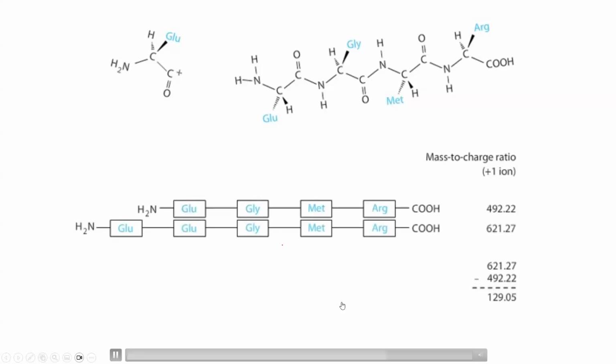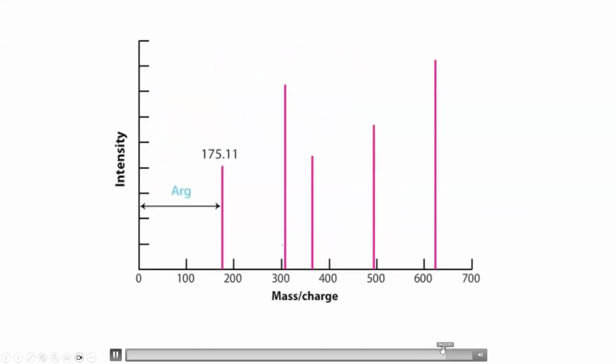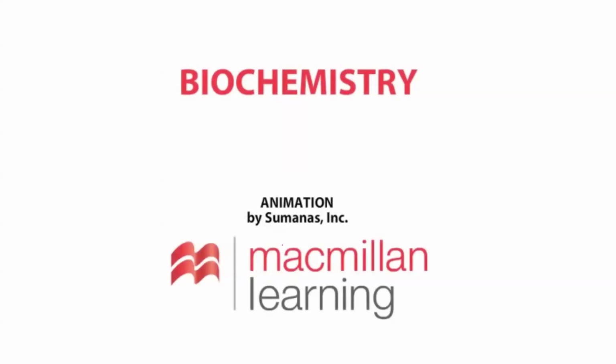So similarly, you can know the different structure. What I want to say is, we can know the mass-to-charge ratio of your amino acid because of this polypeptide. Then you can have this arginine, whatever amino acid is there. You get mass spectra for the fragmented ions, and then you can get what kind of sequence is there. That's why we call it the polypeptide sequence. So that is the method, and you don't need to do this by yourself. You can use some software.